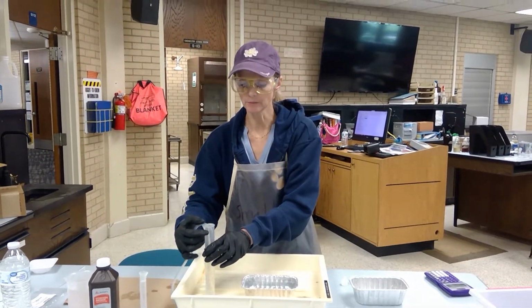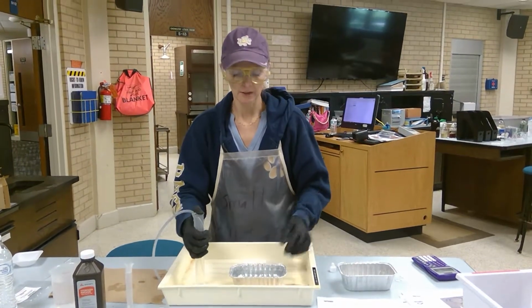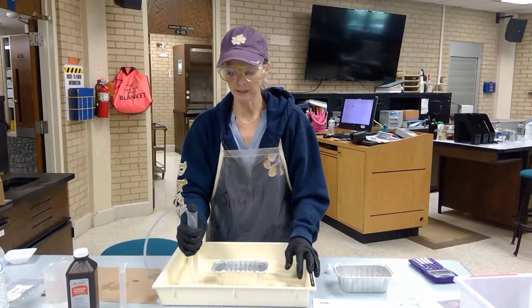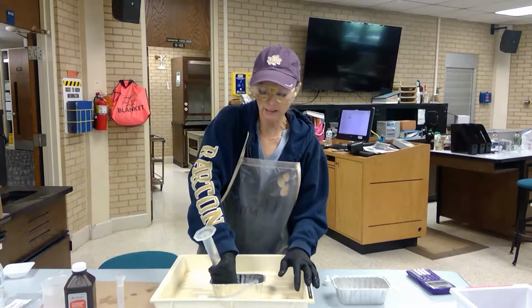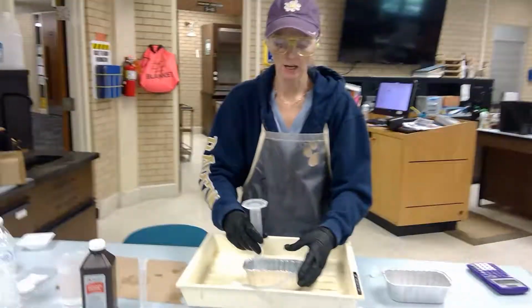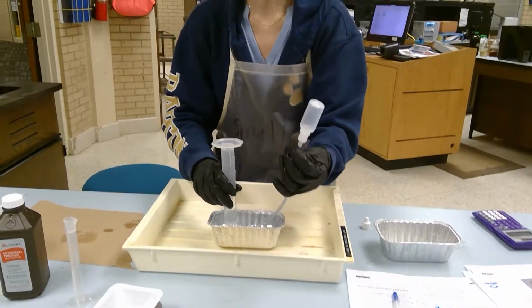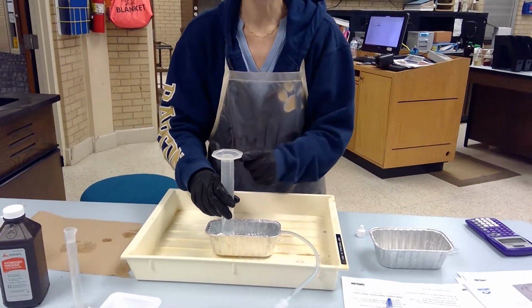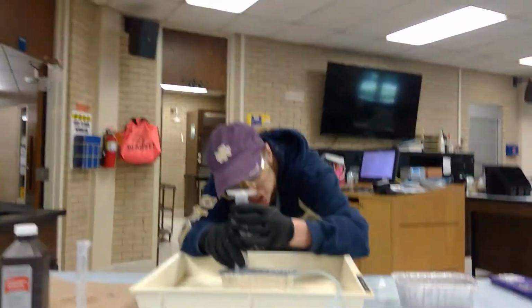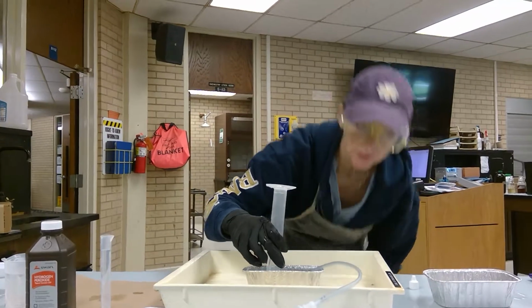You're going to cover the graduated cylinder with your thumb. The reason why you want this pan is because you're going to invert this and pour it into the cake pan that's totally filled with water. And you are going to pre-collect an empty bottle to see whether or not you have any gas. You're going to measure and see how much gas there actually is in this, and I show 2 mL.